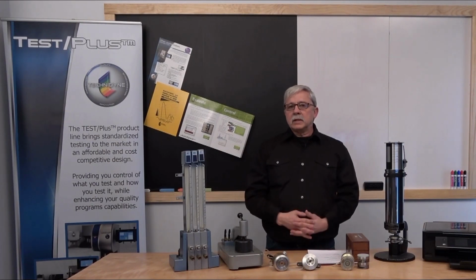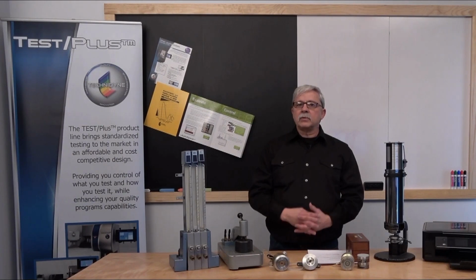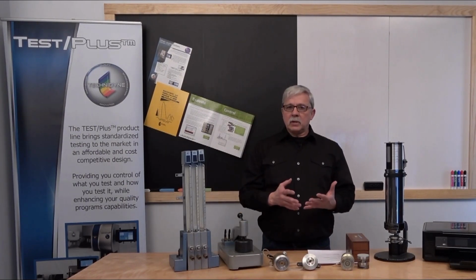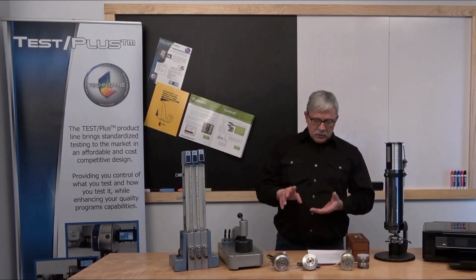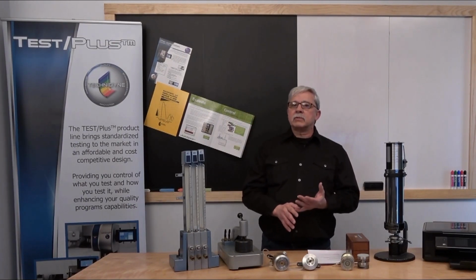The one I want to work on today is a characteristic that we refer to as roughness or smoothness. I'd like to first start out with a little bit of a definition of that particular property, talk to you a little bit about what it is we're measuring, why we're measuring it, how we're measuring it, and a little bit about the history.